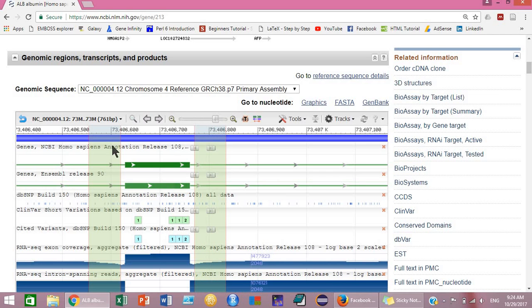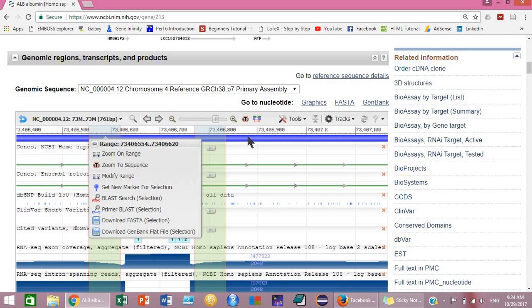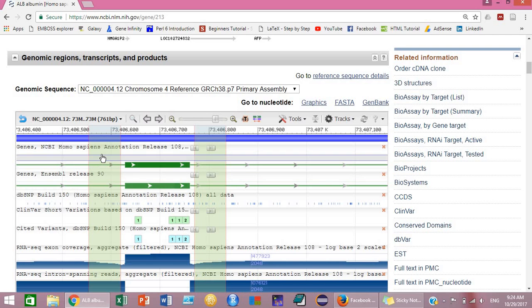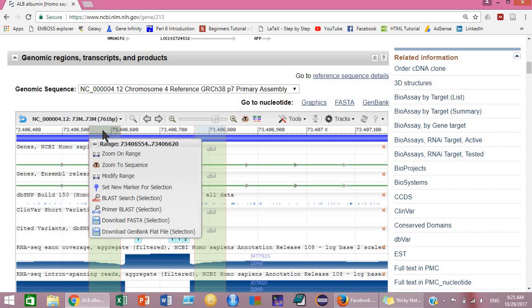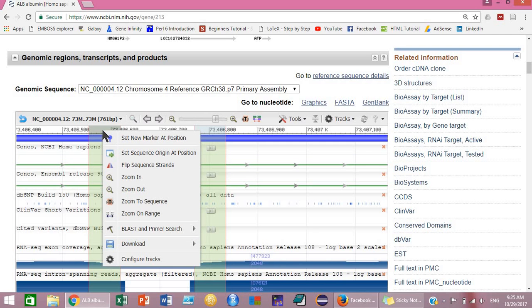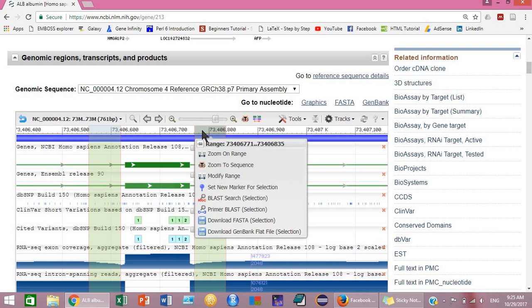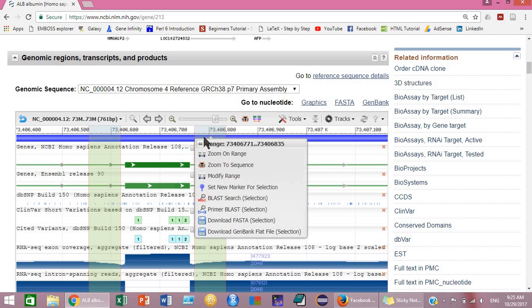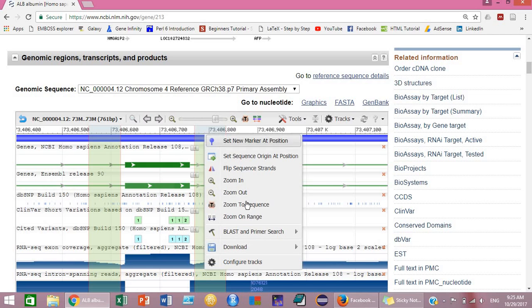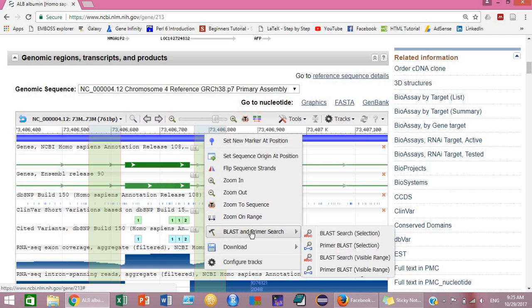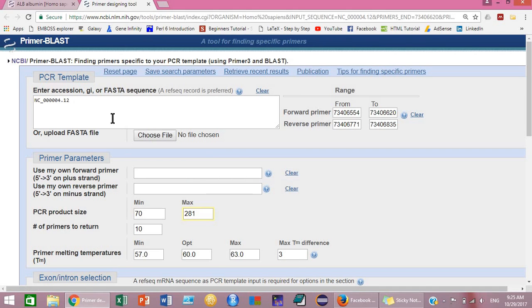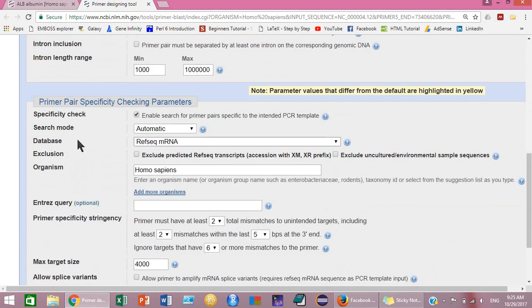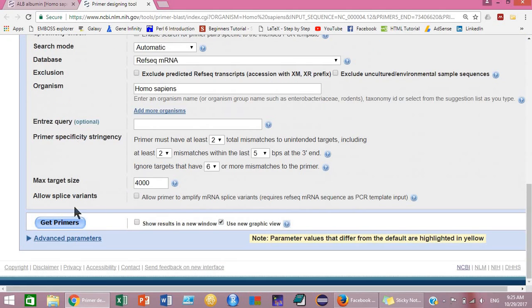Then click on the right mouse button on any one of these areas. You can click here or you can also click on this selected region. So when you click on this selected region, go to BLAST and Primer Search and then Primer BLAST selection.